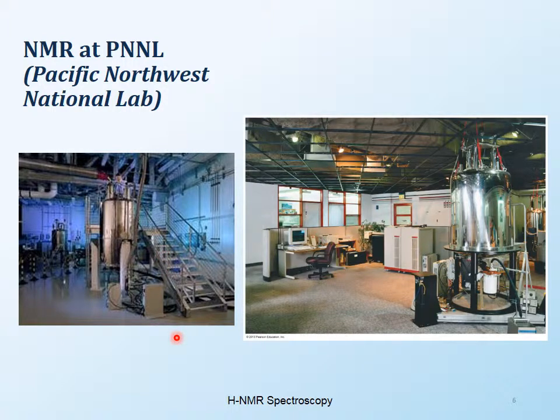The quality of the NMR depends on two things, the magnet and the radio frequency. If you have a really good magnet, you have to have good frequency also. If you have a really good magnet but not a good radio frequency, what's the point? It's like trying to drive a Lamborghini on a dirt road. That's not going to work. For a good road, you need a good car, or for a good car, you need a good road. So that's kind of the thing that happens with the NMR. You need to have a good magnet and a good radio frequency.